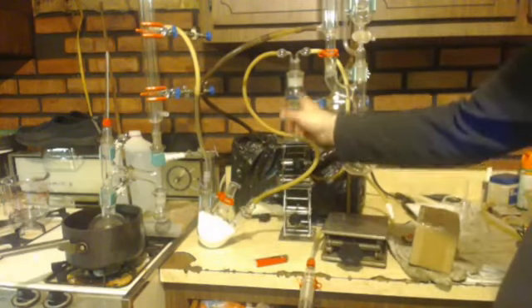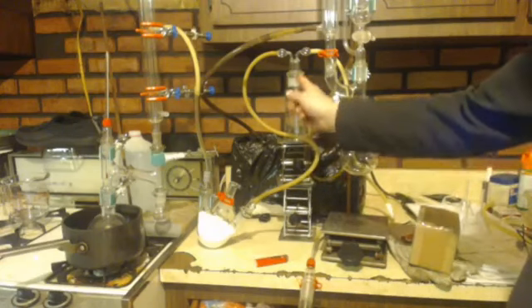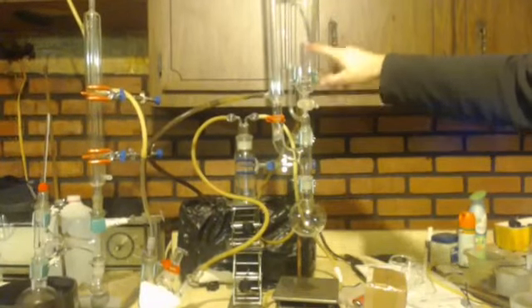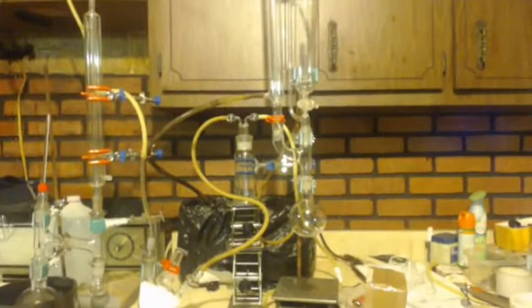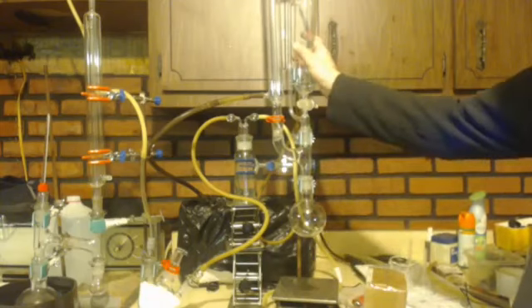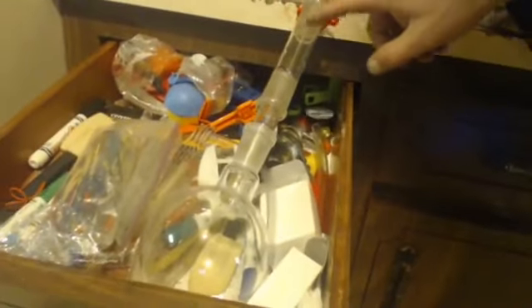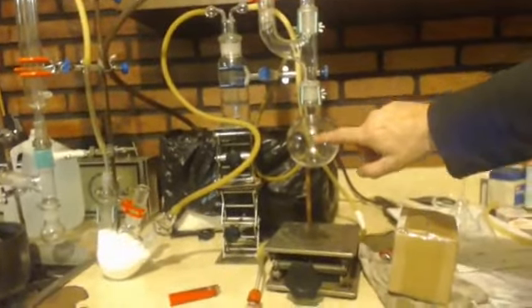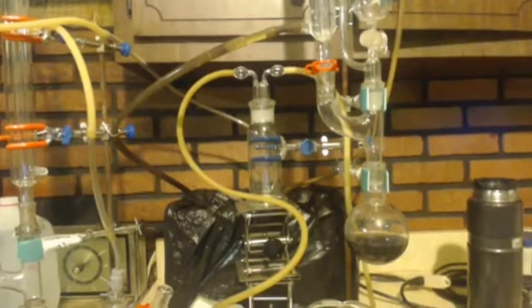Go through this tube into this. This is just a suck back trap right here, okay? And the tube goes down. Right now, it's just going into this bottle here. But what I'm going to do is, after the equalizing funnel is empty and all the ethyl bromide is in here, then I can switch this out. I'll take this equalizing funnel out, and I don't know if you can see, but there's actually a hose inside here, and it'll go all the way down to the bottom of this flask here. Okay, I let it reflux for a half hour.